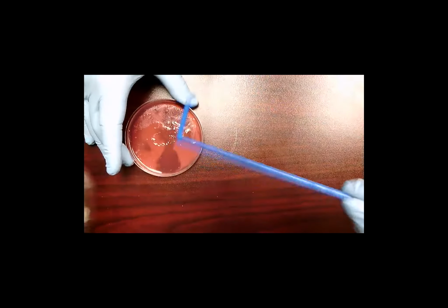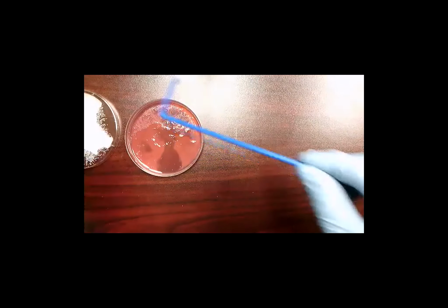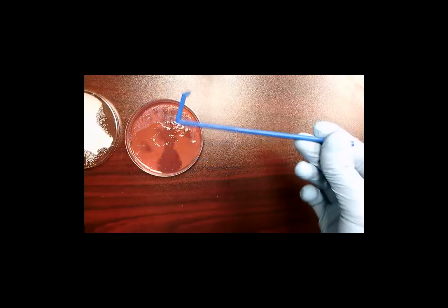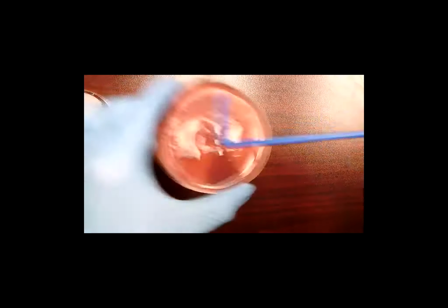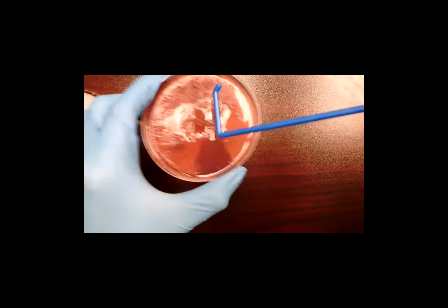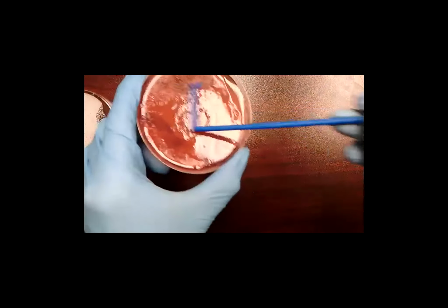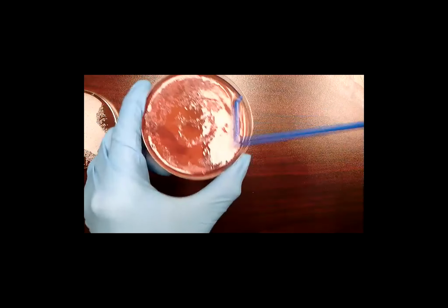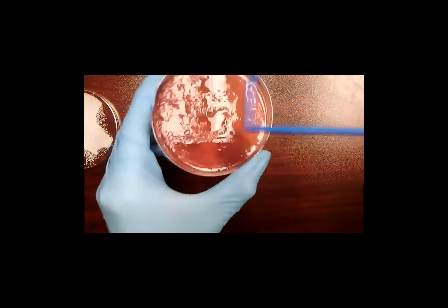Now, probably a little better way is you can set this lid straight on the table, but it does risk a little more contamination, but we have bleach, so we're using precaution. So if you just drop the water, you take the spreader, and now you are actually holding the plate, and you want to put that evenly all throughout there. If it's uneven, you might have clumps of bacteria growth.